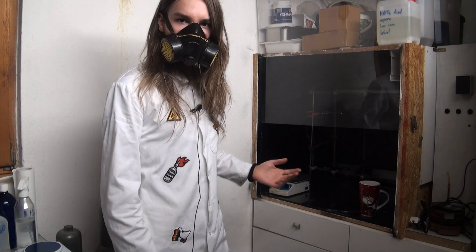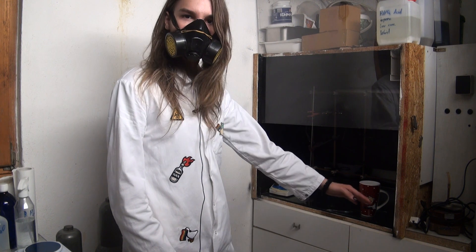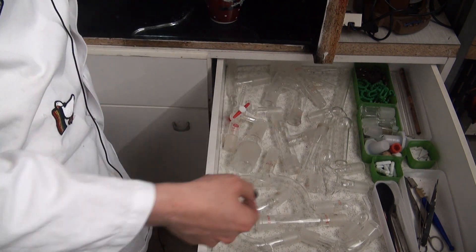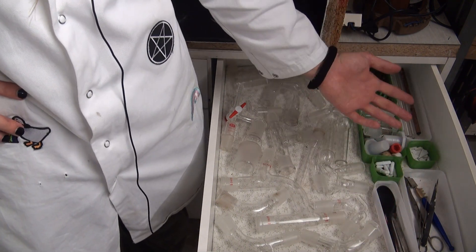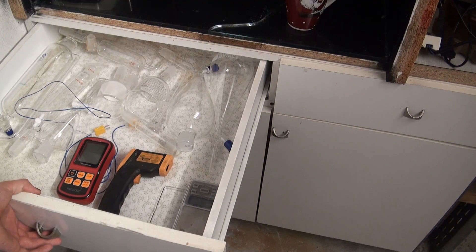And now, lastly, in this corner of the room is my fume hood, with a lot of chemical waste stacked on top and a lot of other miscellaneous stuff. Underneath my fume hood I also have this little cabinet filled with a lot of fun stuff — a large amount of glass fittings, glass adapters for different sizes, gas adapters for vacuum, for temperature gauges, drying tubes, pinchers, spoons, stoppers, stir rods, stir bars, clamps, and everything like that.